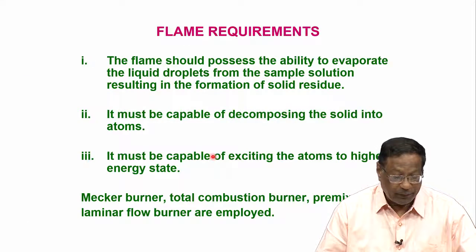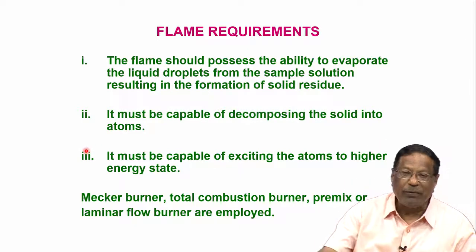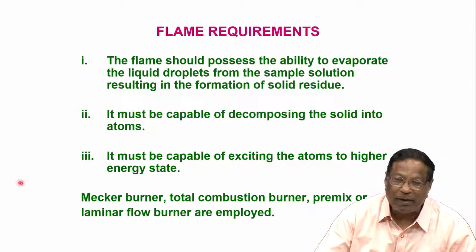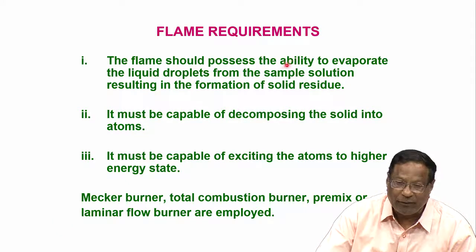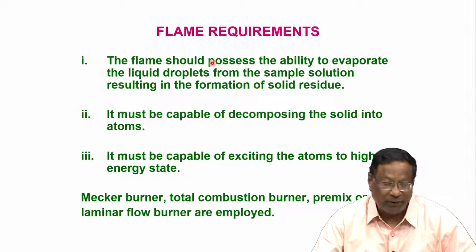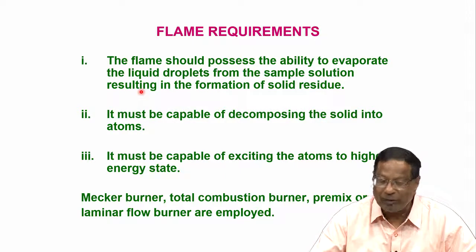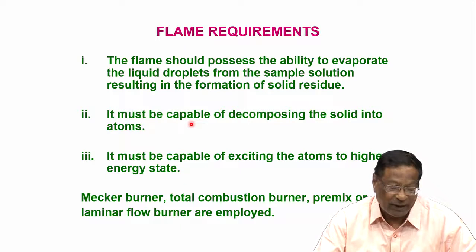Okay. So, what are the requirements of the flame? What kind of flame do we require in flame atomic emission spectrometry? First of all, the flame should possess the ability to evaporate the liquid droplets from the sample solution, resulting in the formation of the solid residue. The mechanism of this I have already given earlier. It must be capable of decomposing the solid into atoms, and it must be capable of exciting the atoms to a higher energy state.